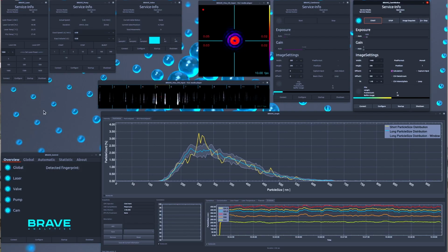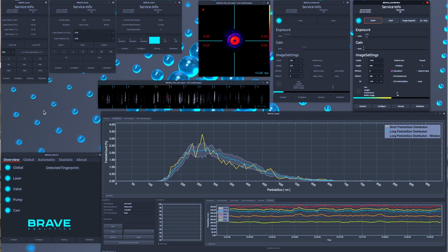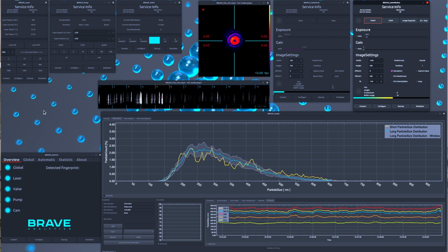Basically, we're talking about a closed system, which runs on Linux. When you think of OF2I, then H.A.N.S is your guy. H.A.N.S shows you the monitoring results of your sample in real time. Behind the scenes, he's controlling and monitoring all the components for the OF2I detection unit and the sample preparation. We're basically talking about pumps, valves, lasers, optics, and built-in electronic components.